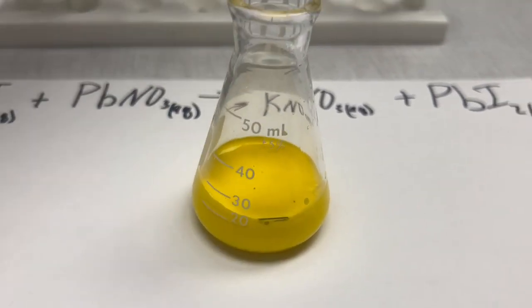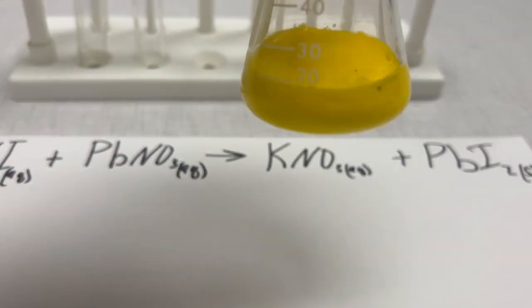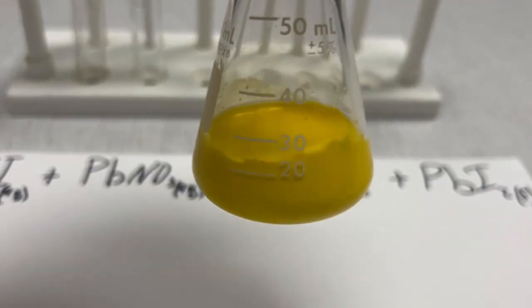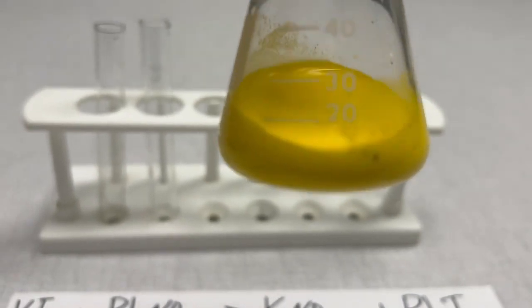And as soon as we add it, we get a really obvious chunky yellow color that comes from this.